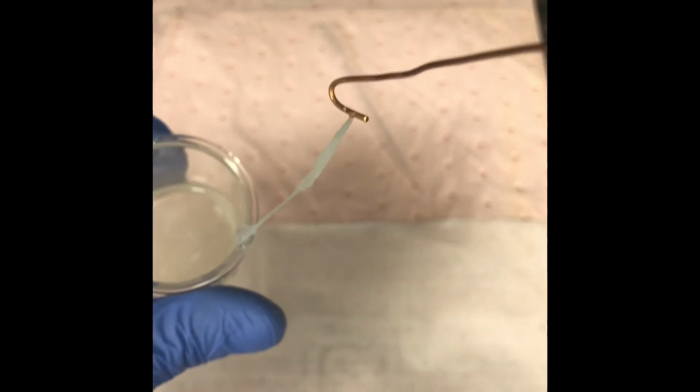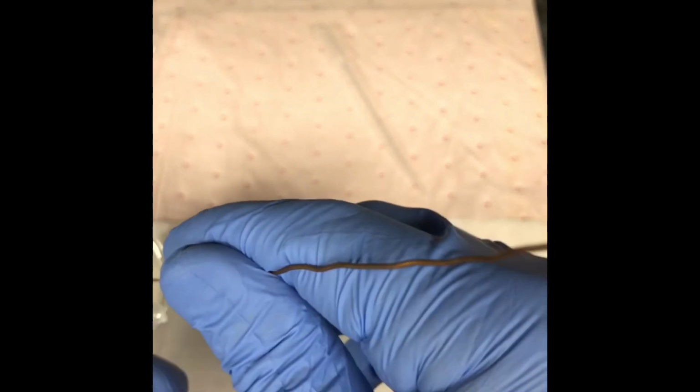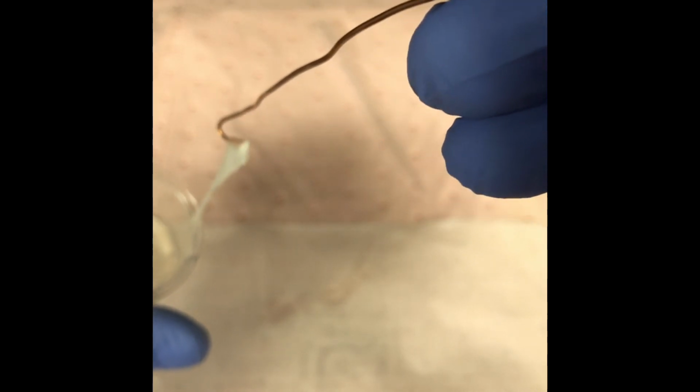Watch this. Oh, look at that. The strand broke. That's not useful. But that's because I don't have as much skill as some people, I guess. Or maybe I'm a little too hasty. So I'm going to pull this nylon out carefully and slowly. Looks like it breaks again. So I obviously wouldn't win the prize for the longest strand, but maybe it'll get better over time.